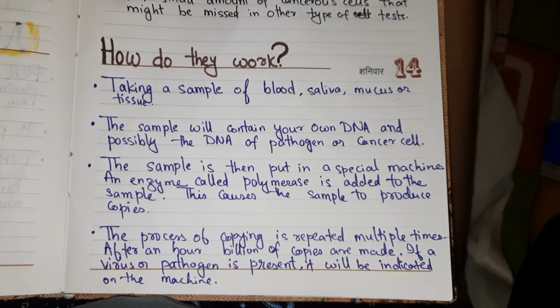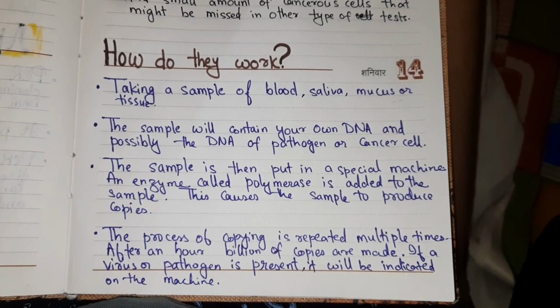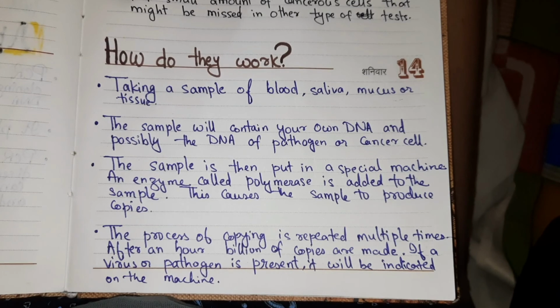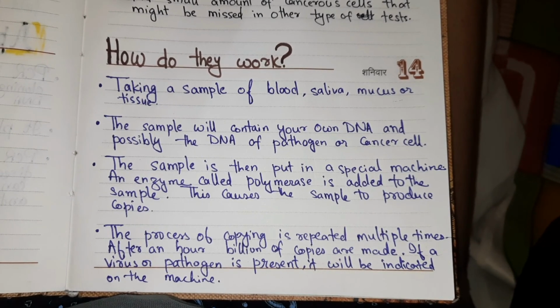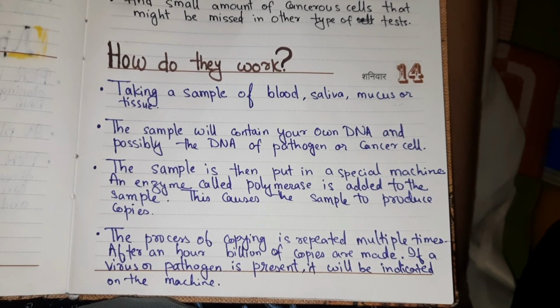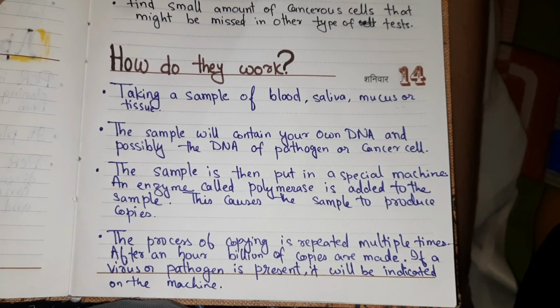The sample is then put in a special machine. An enzyme called polymerase is added to the sample. This causes the sample to produce copies. And then in the last step, the process of copying is repeated multiple times. After an hour, billions of copies are made. If a virus or pathogen is present, it will be indicated on the machine.